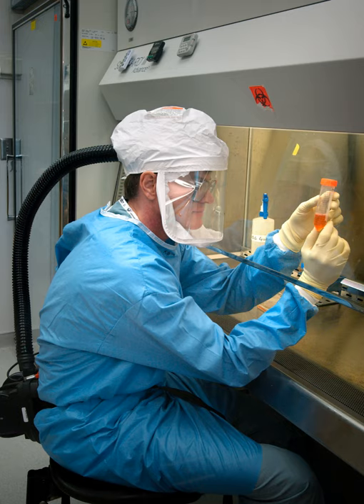Additionally, there is the risk that contaminated air would flow into the laboratory if the exhaust system for a Type B1 or B2 cabinet were to fail. To mitigate this risk, cabinets of these types generally monitor the exhaust flow, shutting off the supply blower and sounding an alarm if the exhaust flow is insufficient.